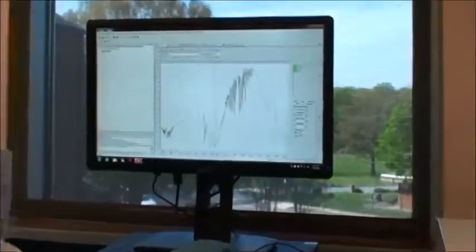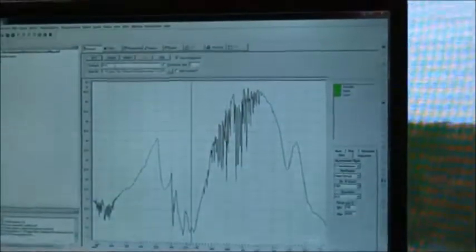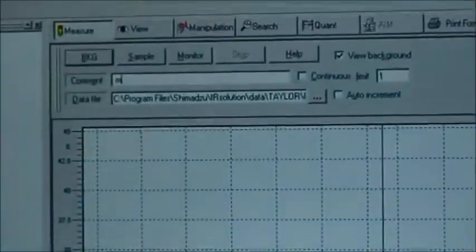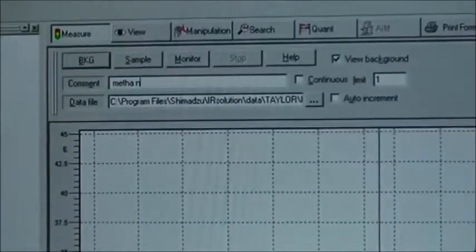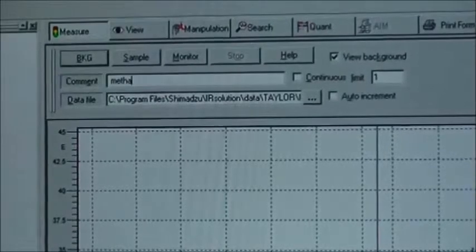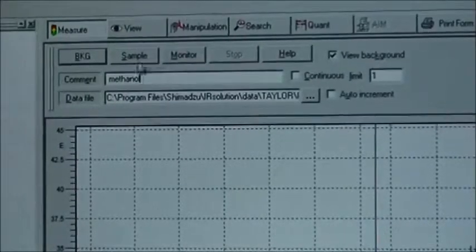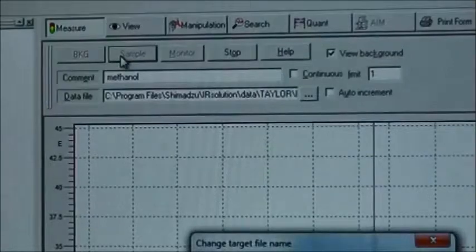This is before you run it. You can say where you want to save it, any comments that you have. So I'm just going to go ahead and label this methanol. And now go ahead and run our sample.